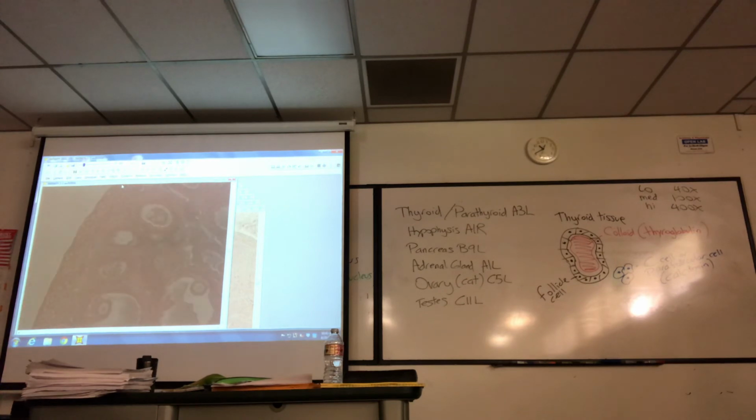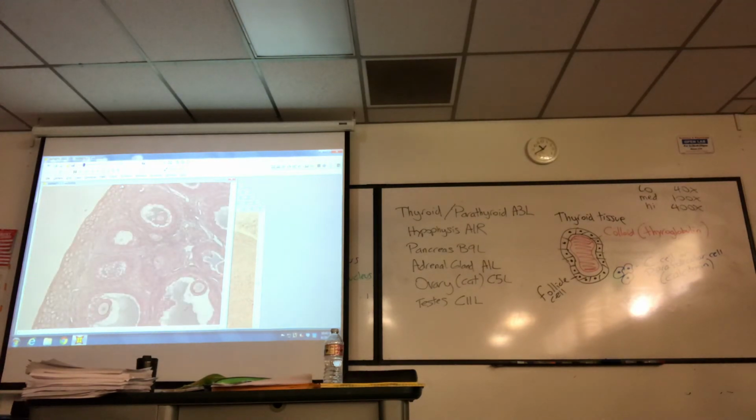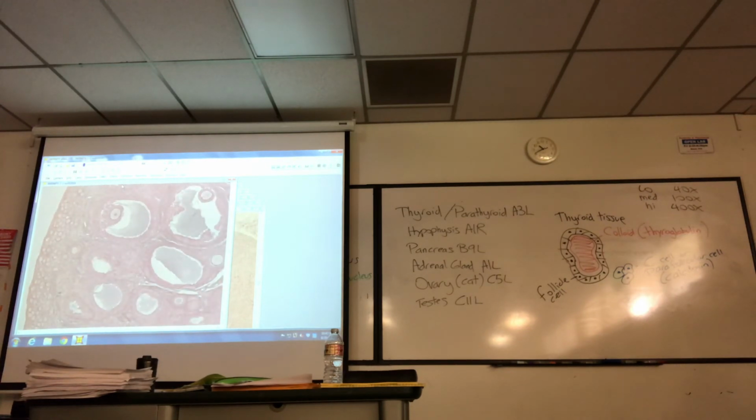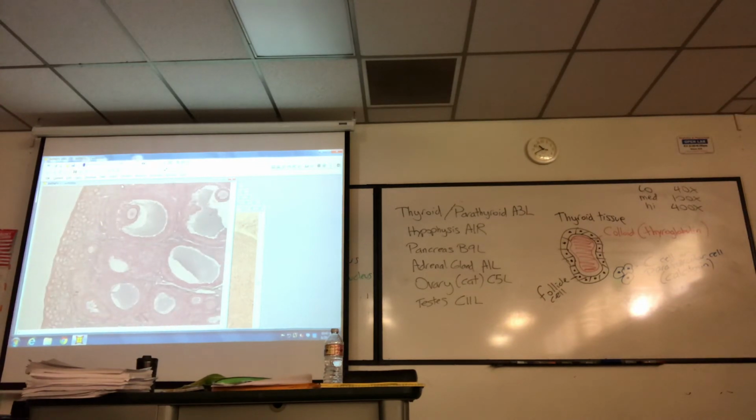Here's medium magnification. That's pretty good. Take a picture of that. So we're looking at cat ovary. Works better. We have human ovary slides, but as a teaching thing, the cat one is better.